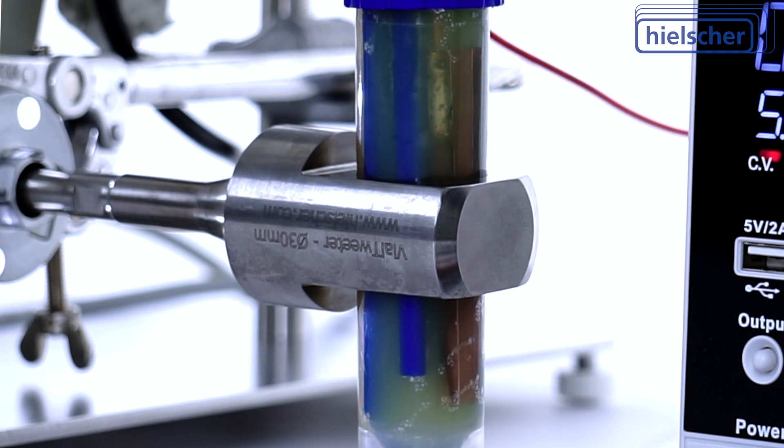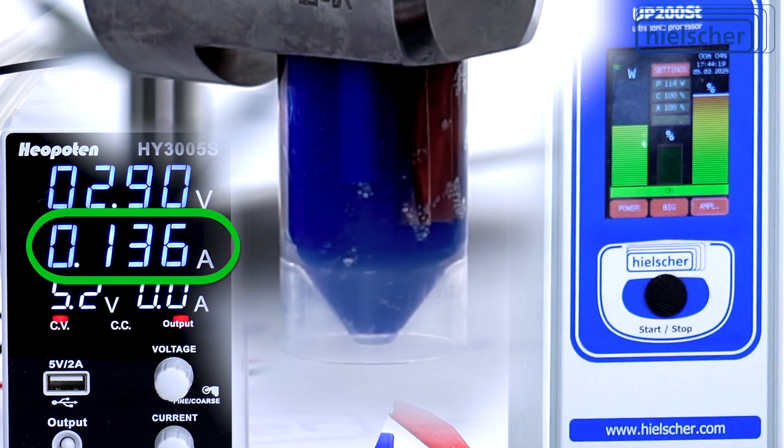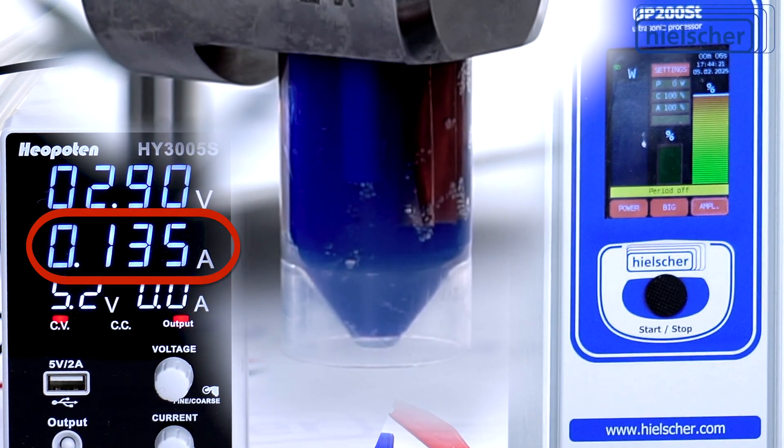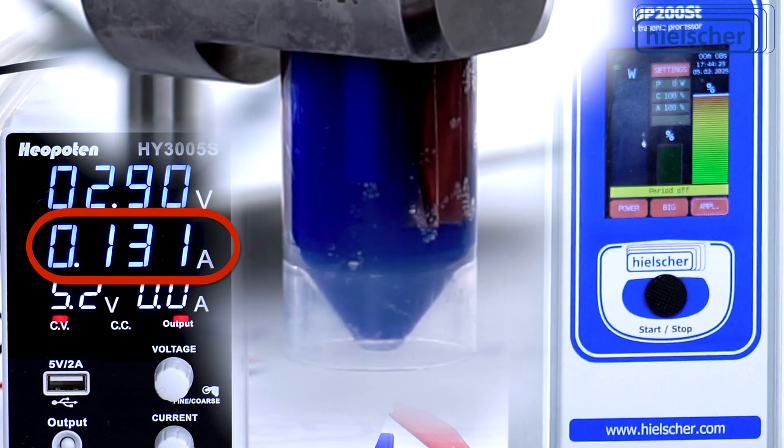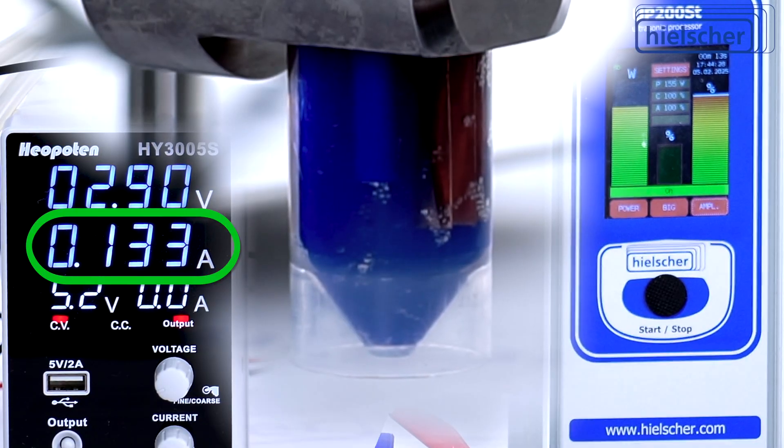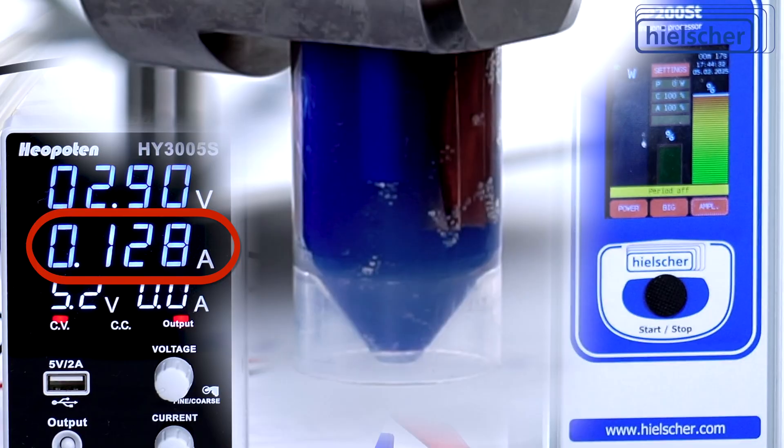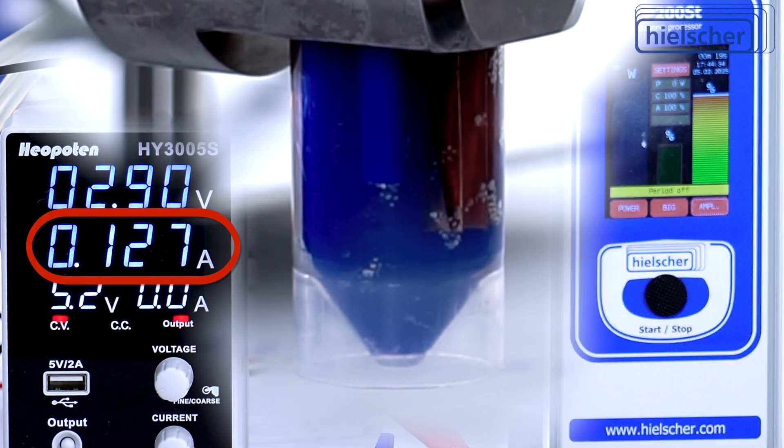This is primarily achieved by removing bubbles and enhancing mass transfer at the electrode surfaces. You can clearly see how the electric current rises during each sonication interval, illustrating how sonication removes gas bubbles that would otherwise inhibit electrolysis. This synergy boosts current flow and accelerates reaction rates, making the Vial Tweeter an indispensable tool for chemical engineers seeking to optimize electrochemical processes.